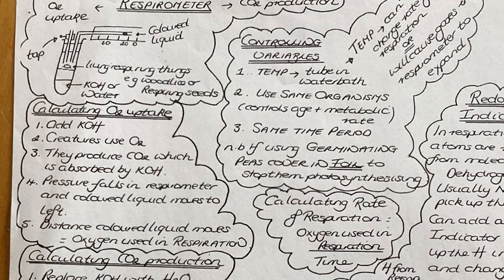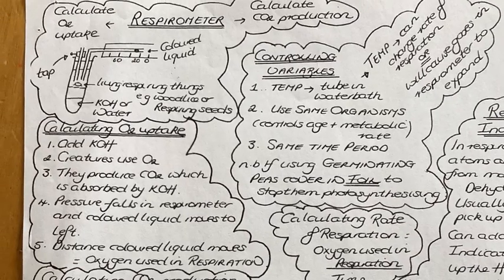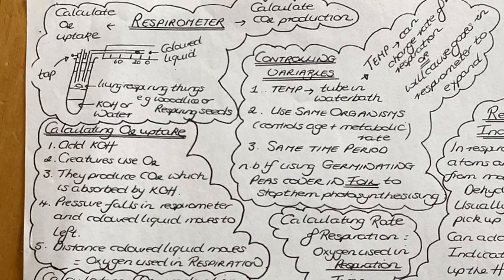Hello, I'm just going to talk you through the respirometer really quickly. And remember, once I've done this, find your past paper questions and check that you can answer them in accordance with the mark scheme. So here we go.